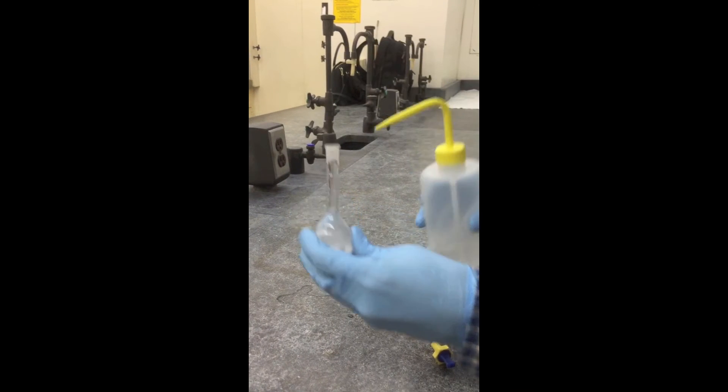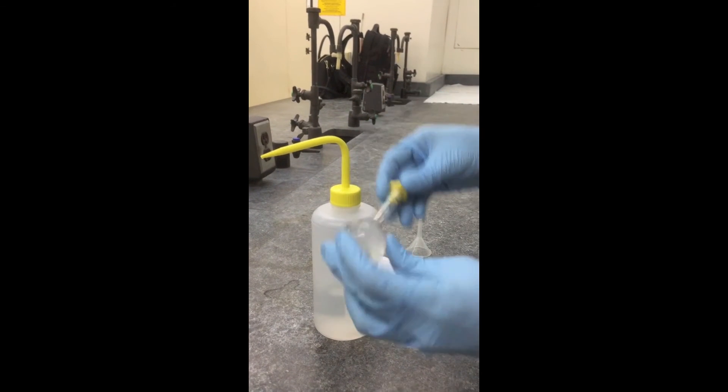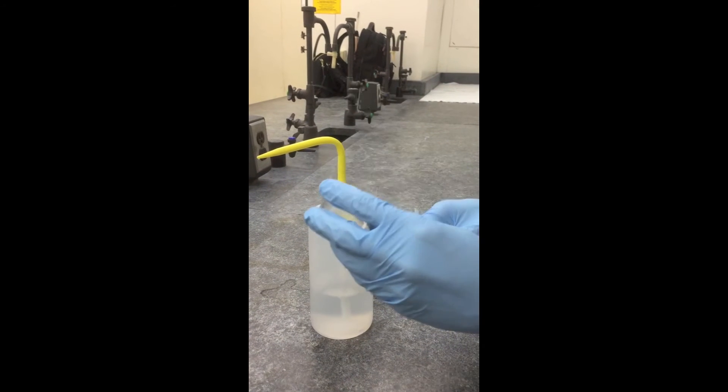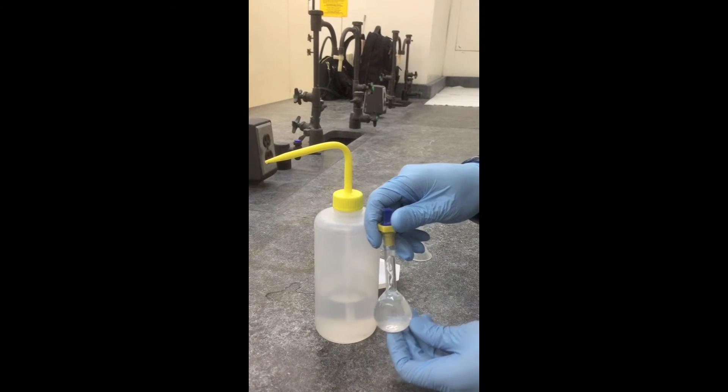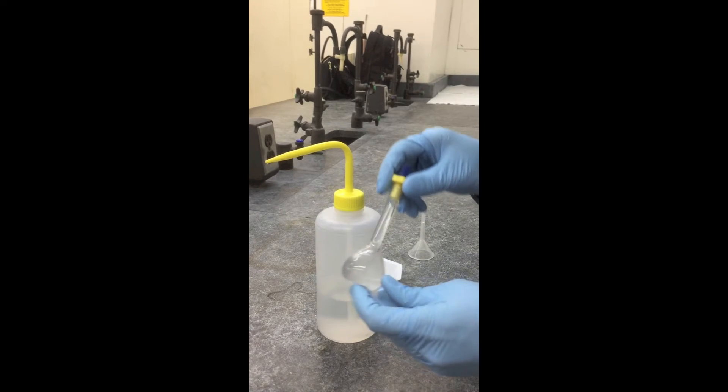Carefully add more distilled water nearing the volumetric calibration mark. Stopper the solution and invert multiple times in order to help dissolve the solute.